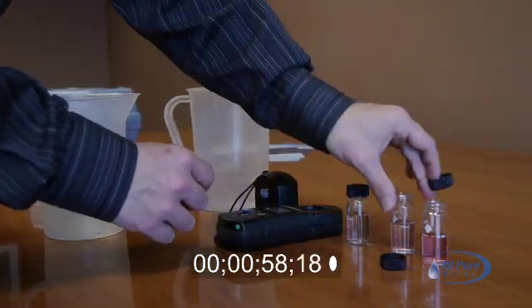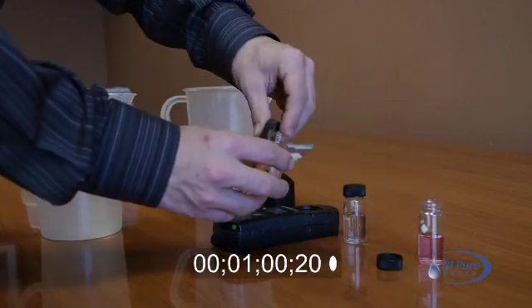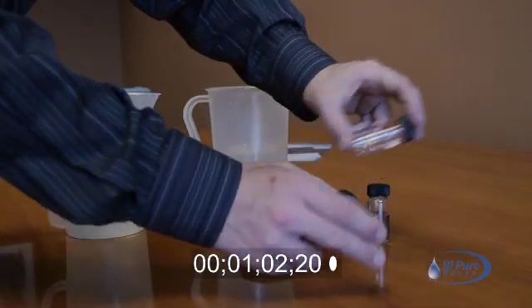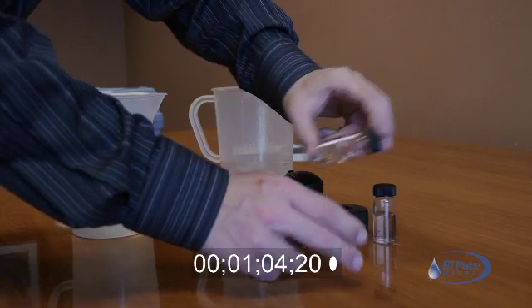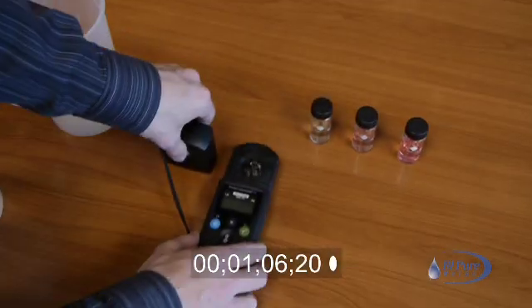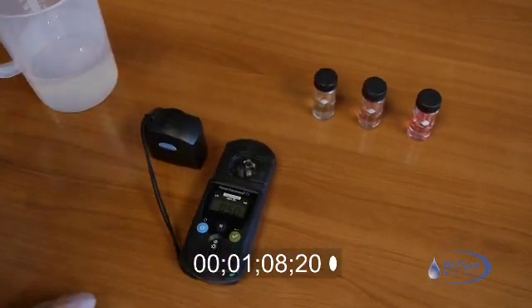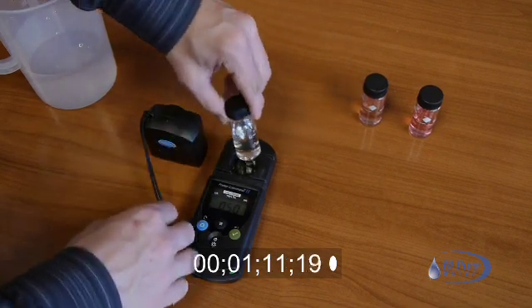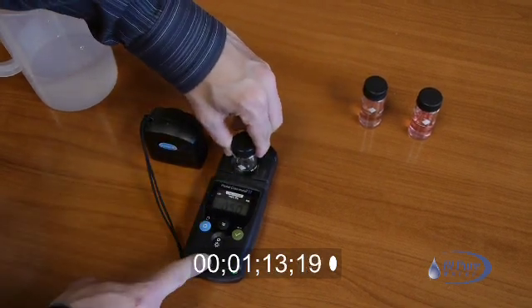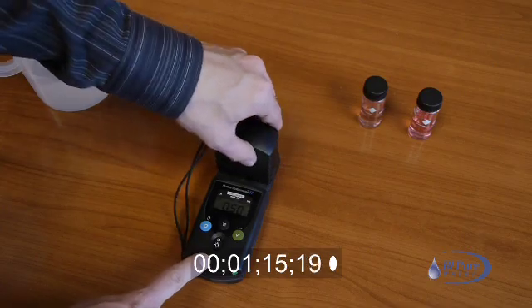Put the caps on the tubes and agitate. Turn on the colorimeter and place the reference sample, pointing the diamond towards the center of the instrument. Put the measurement cap on.